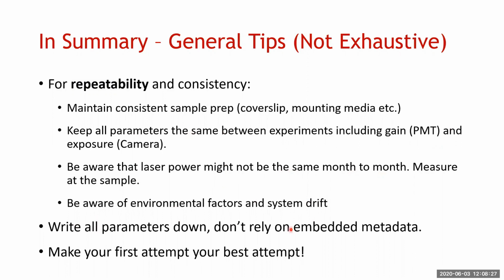I've put down here to write your parameters down and don't rely on embedded data. We've had some issues where, if you export your image as a TIFF or a JPEG, then that metadata is no longer embedded. So better safe than sorry. Write that stuff down and you won't regret it. Finally, make your first attempt your best attempt, and you don't have to be going back all the time to redo your imaging.